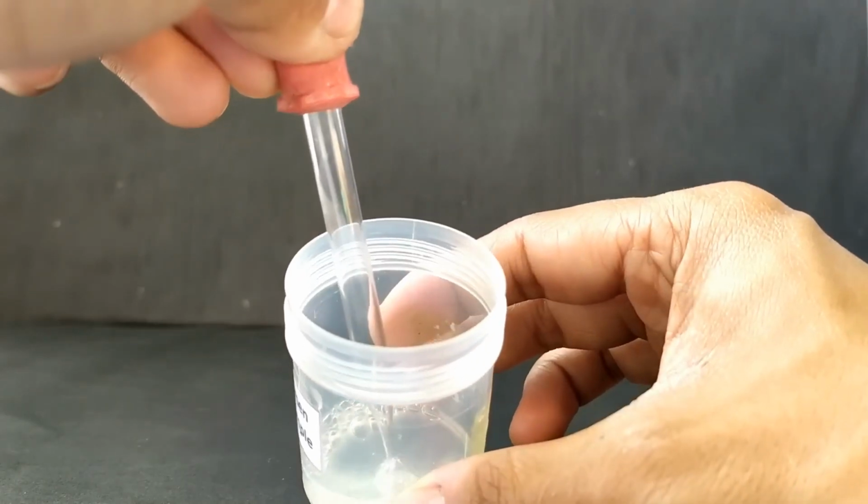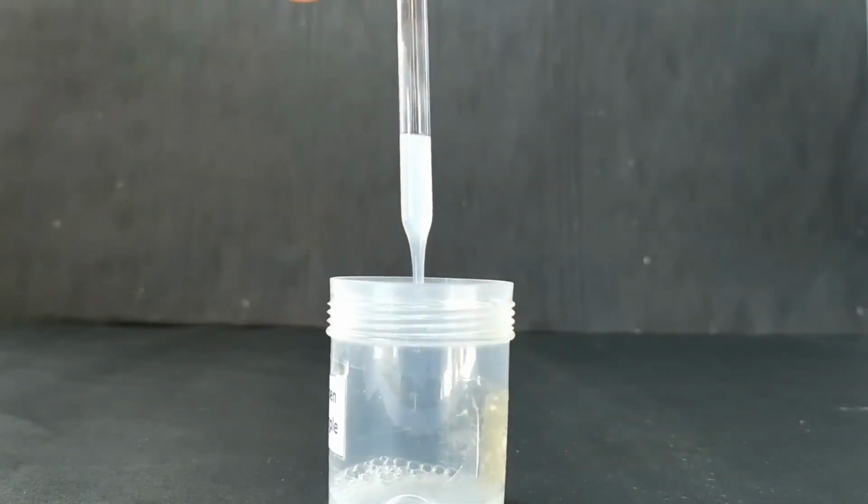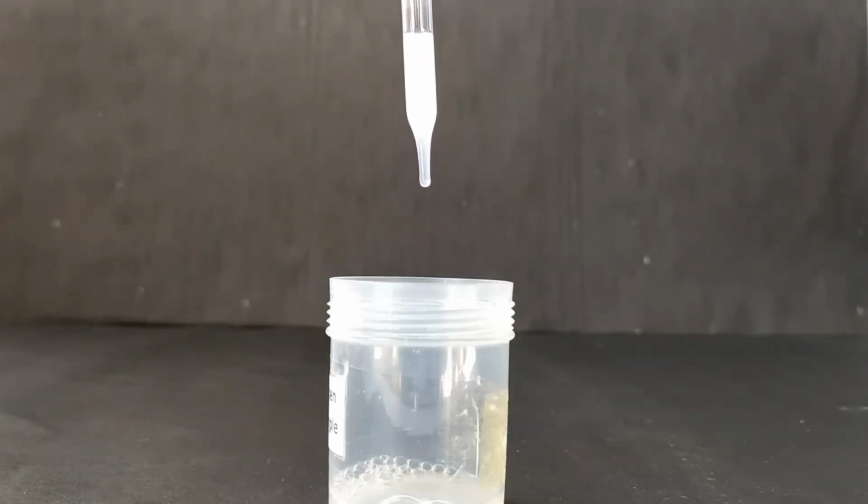The viscosity of semen is determined on a sample that had already been through liquefaction. When normal semen is drawn in a narrow tube or dropper and allowed to dispense from the tube by the force of gravity, it flows out of the tube in the form of medium-sized discrete drops without any trailing strands.